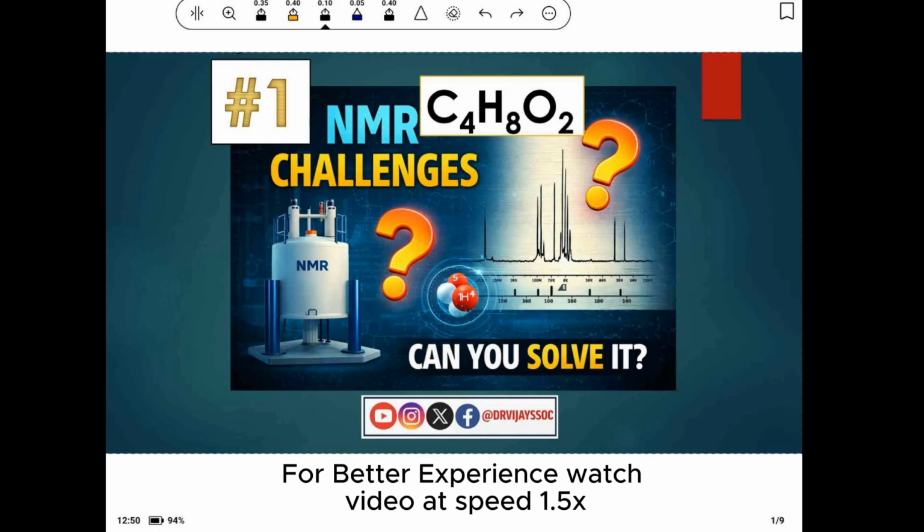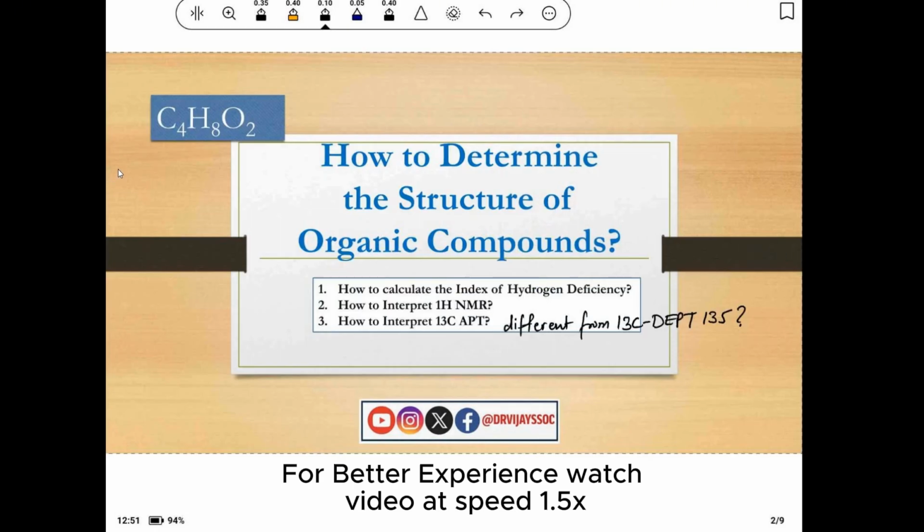So here is our first NMR challenge. We are going to determine the structure of this organic compound whose molecular formula is C4H8O2. While determining the structure of this compound, we will learn how to calculate the index of hydrogen deficiency, how to interpret 1H NMR, and how to extract the information from 1H NMR. And then we will see how to interpret 13C APT NMR and what is APT, and we will understand how it is different from 13C DEPT 135 NMR.